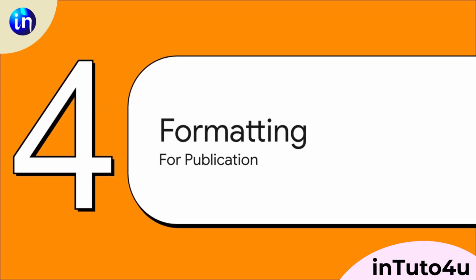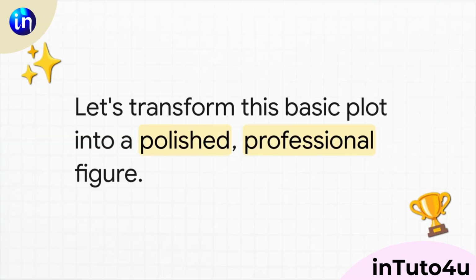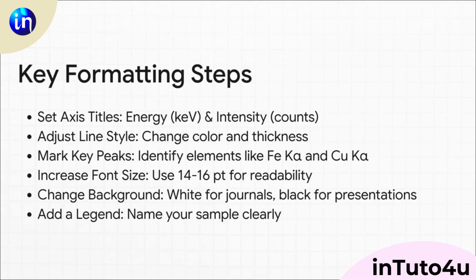Okay, this is where the magic happens. This is how we take a quick and dirty draft and turn it into a professional figure. The basic plot does its job, sure, but the formatting is what gives it real clarity, impact, and that polished finish. So let's get to it. We're going to take this raw output and basically sculpt it into something that you'd be genuinely proud to put in a publication. Here's our game plan.